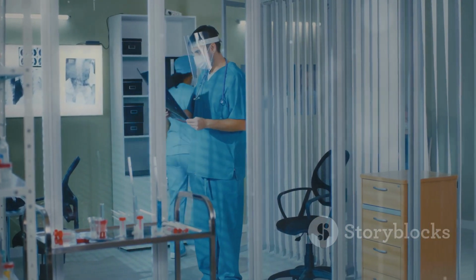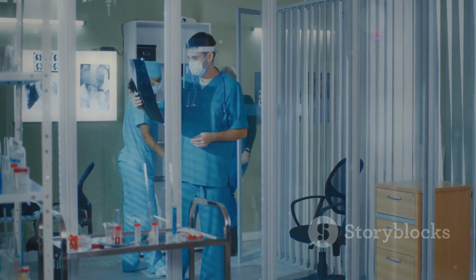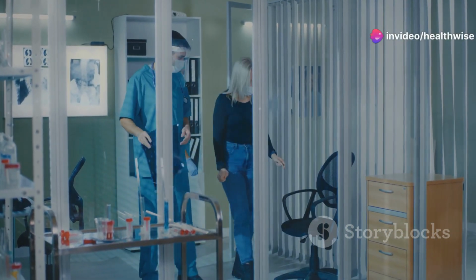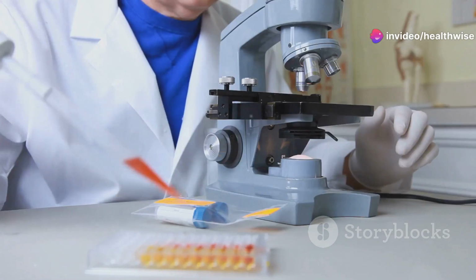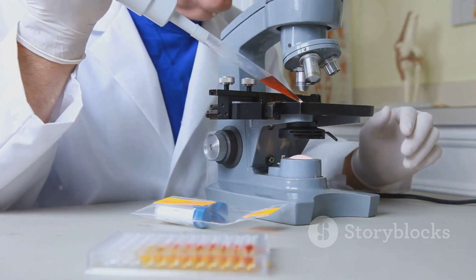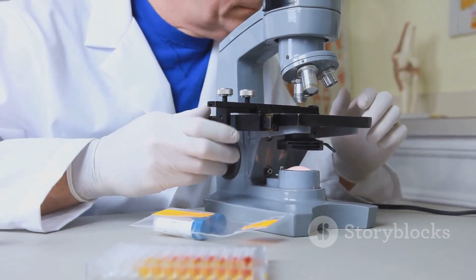Today, I'm walking you through the procedure for a direct wet preparation microscopic exam. This is an essential skill for any budding medical professional. This method is quick, effective, and invaluable for examining freshly passed feces. It allows us to identify various components that can provide critical insights into a patient's health.